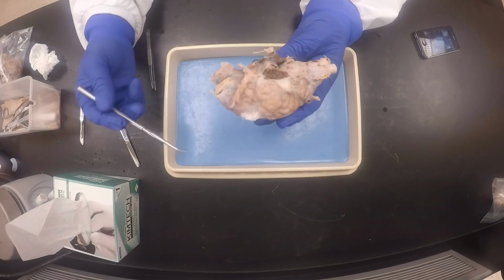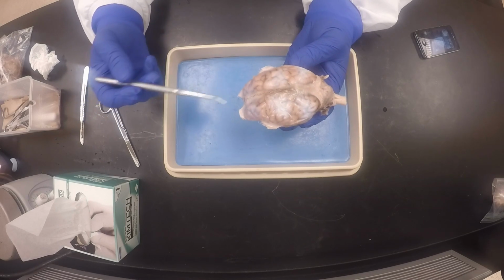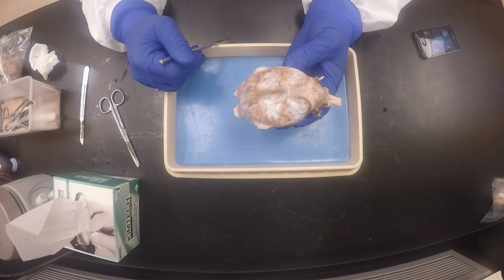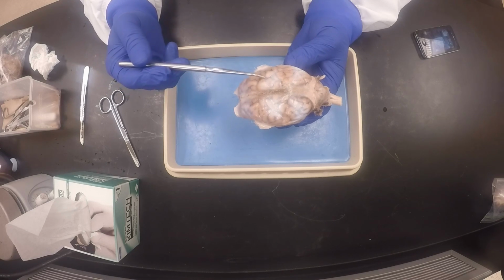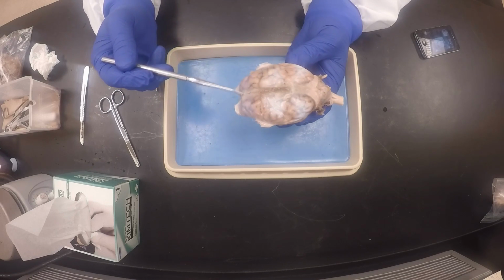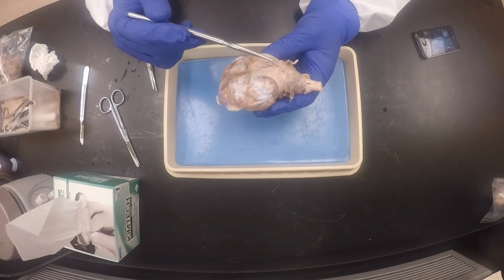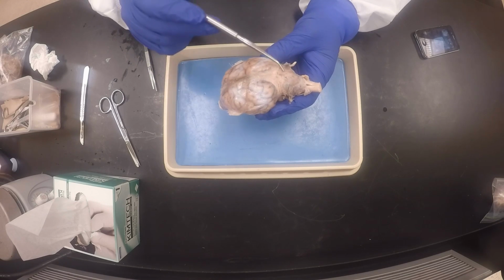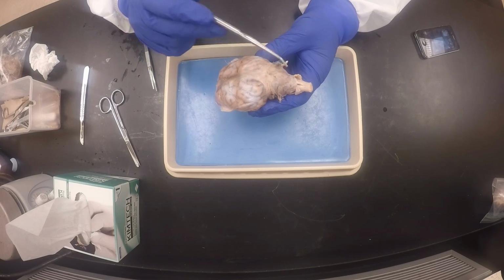Okay, and then on the top, I want you to identify these other structures. This whitish layer is the dura mater. And this here will be the falx cerebri, because it separates the 2 hemispheres. This will be the tentorium cerebelli, which separates the cerebrum from the cerebellum. And this here is the falx cerebelli, which separates the cerebellar hemispheres.